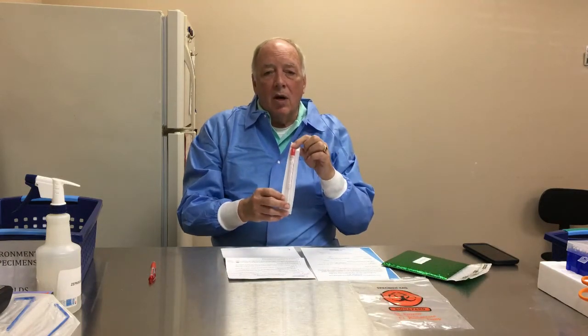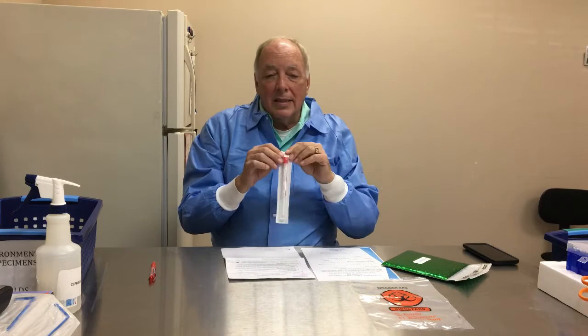In the envelope you will have a biohazard bag, which is much like a sandwich bag but has the word 'biohazard' on it. You will have a sterile swab that is sealed — make sure it's sealed — and then you will have three pieces of paper: the instructions listing our sampling options, a chain of custody form, and a credit card authorization.